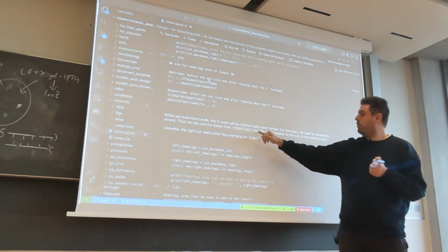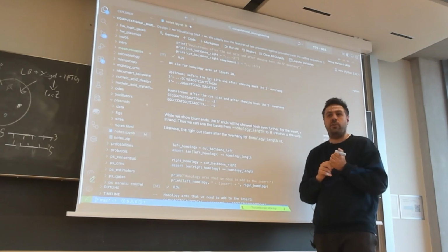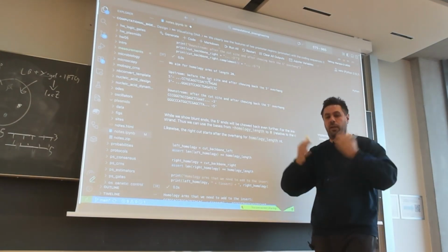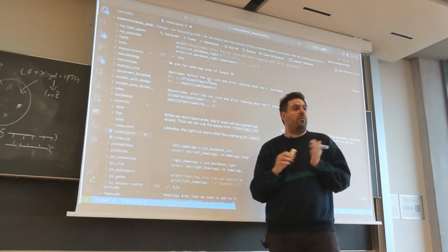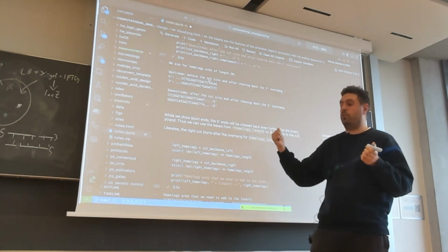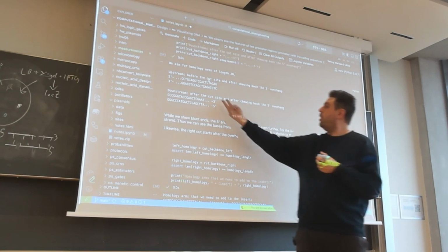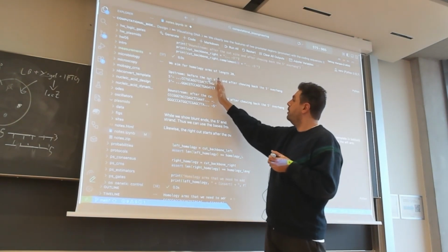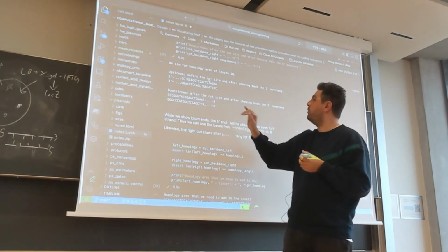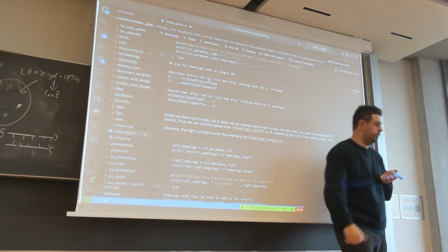For the Gibson cloning, what we need is a homology length of around 20. This is what the protocol tells us. In fact, it depends on the number of fragments and the length of the fragment, but with 20 you are almost always quite well off for a few fragments. We have one fragment that we want to insert, so completely fine. Now that we have the sequence upstream and downstream of the cut, it's very easy to get a 20 homology from this. Just a few lines of code again.